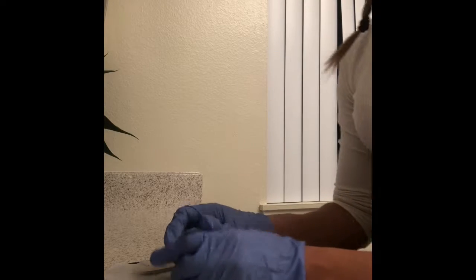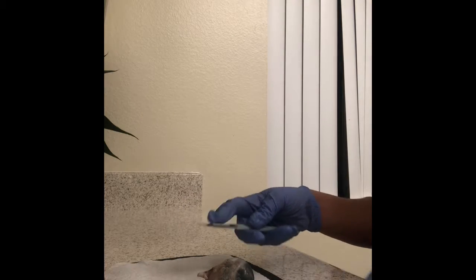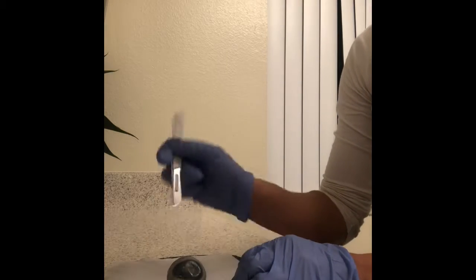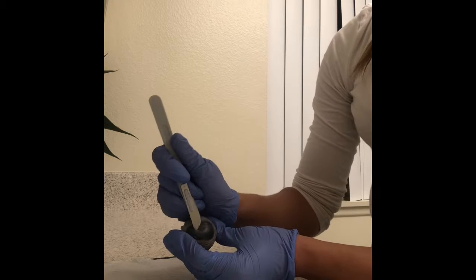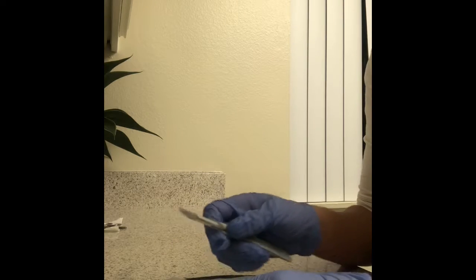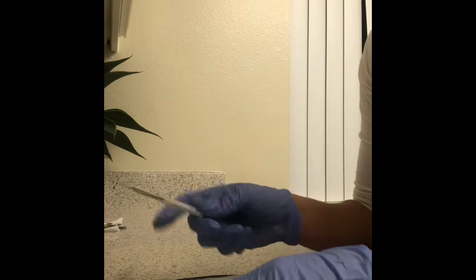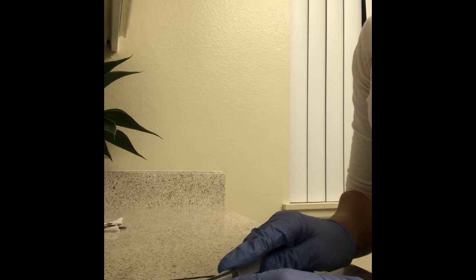Okay, so what I'm going to do first is cut into the anterior chamber of the eye. So I'm going to be cutting into the cornea of the eye with this scalpel right here. So we've cut into the cornea of the eye. Now we're going to be cutting the eye into an anterior and posterior portion. We're going to cut the portion of the chamber of the eye and view the interior. We'll do that right now.